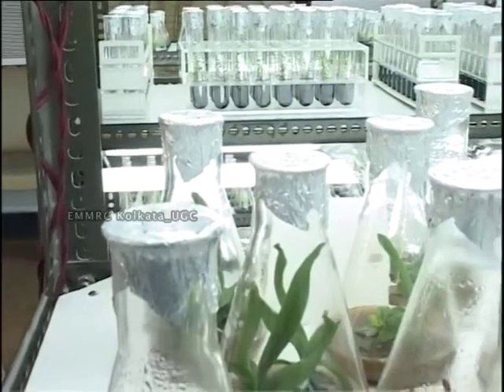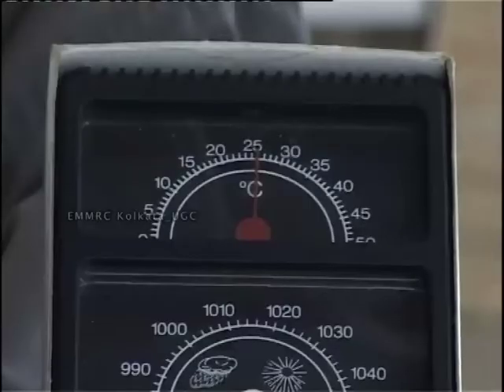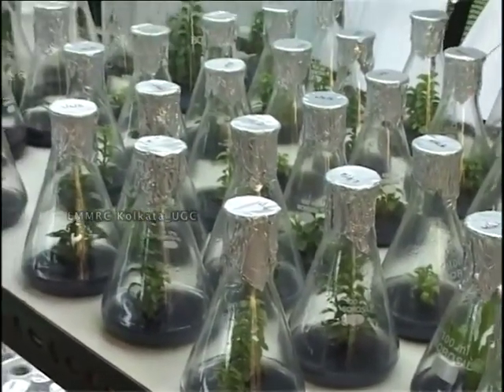The temperature inside the culture room is constantly checked. In this case, it is 25 degrees Celsius and the humidity is about 70%. Normally, the humidity is kept between 60 and 70%.